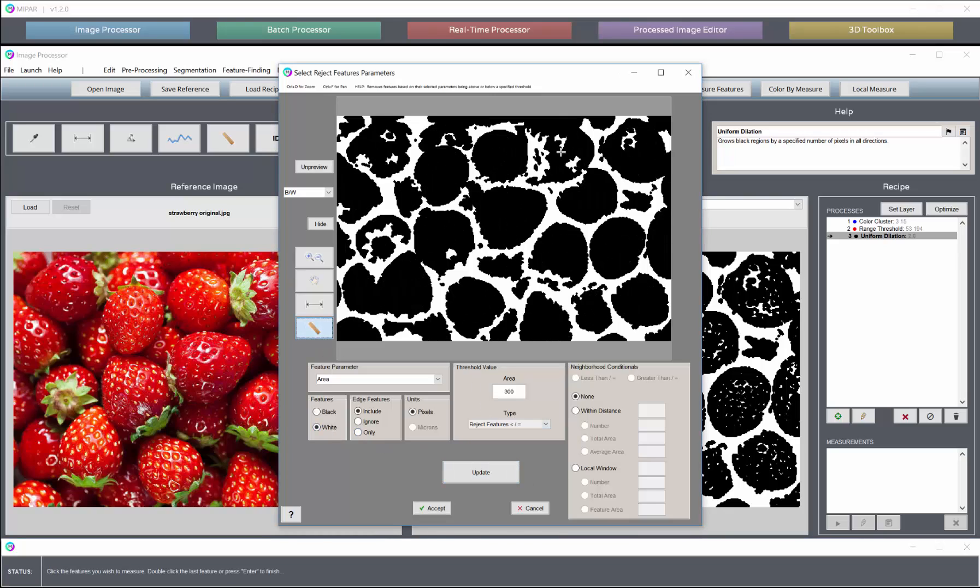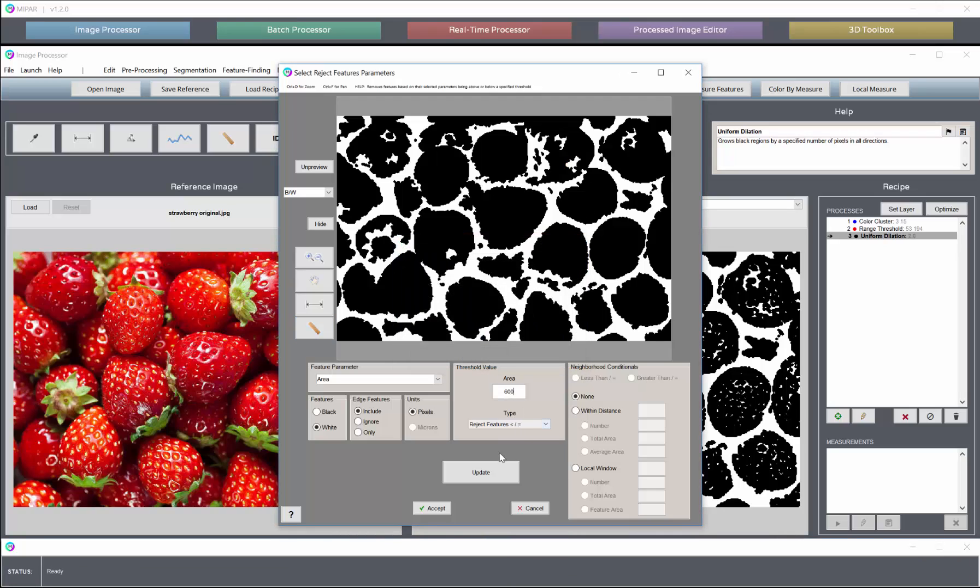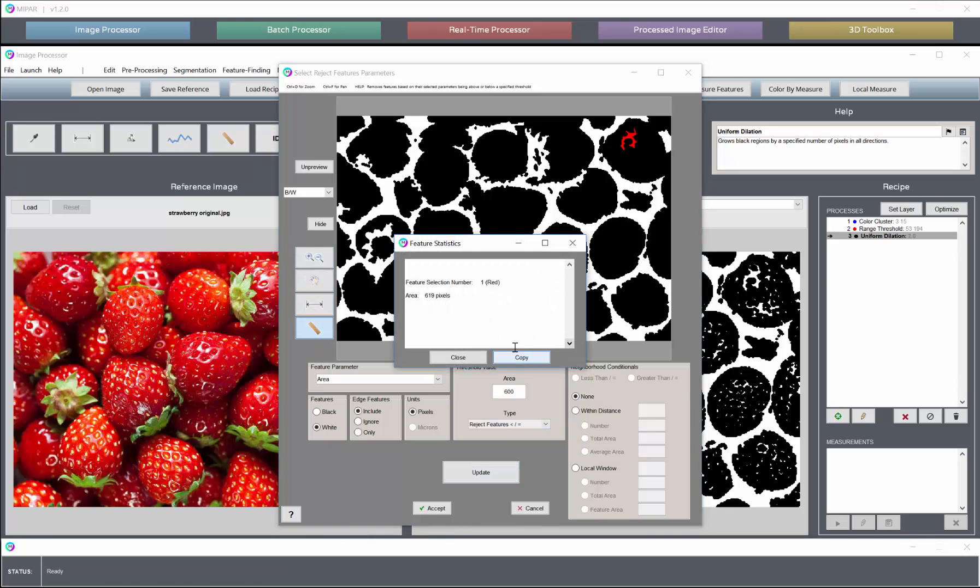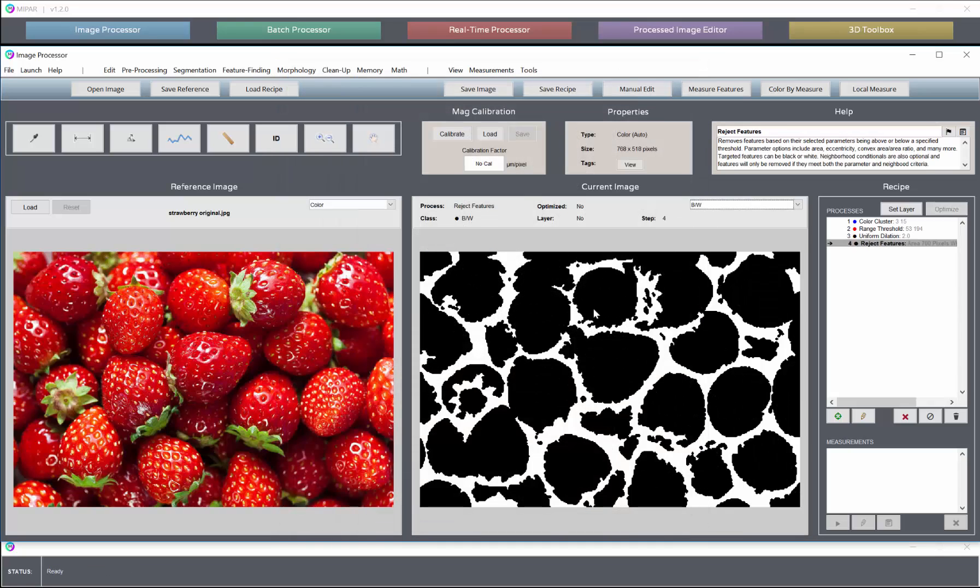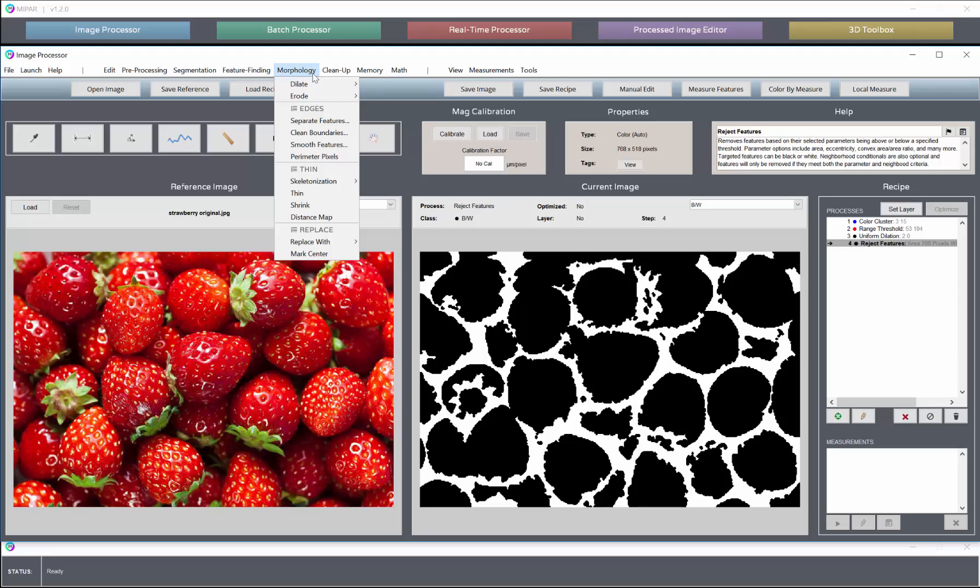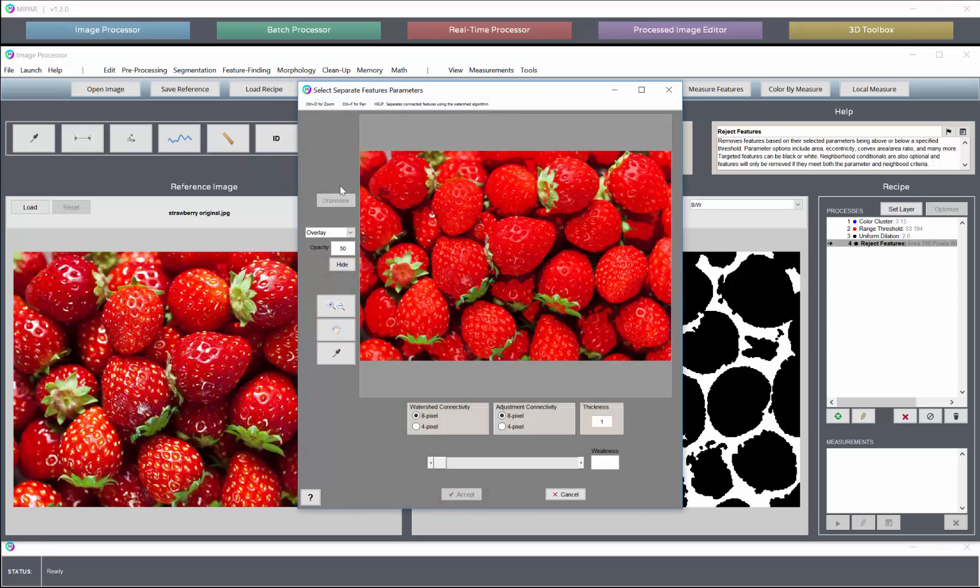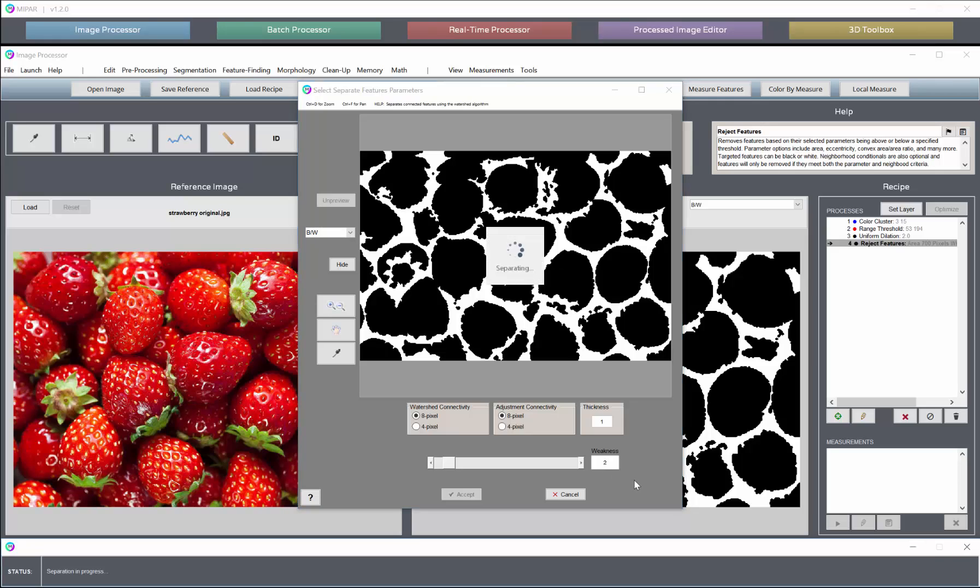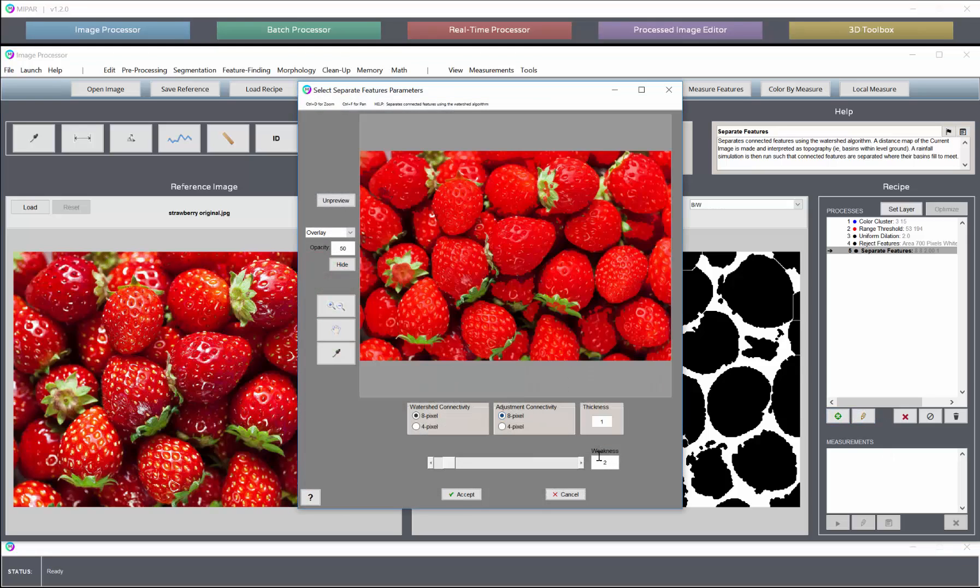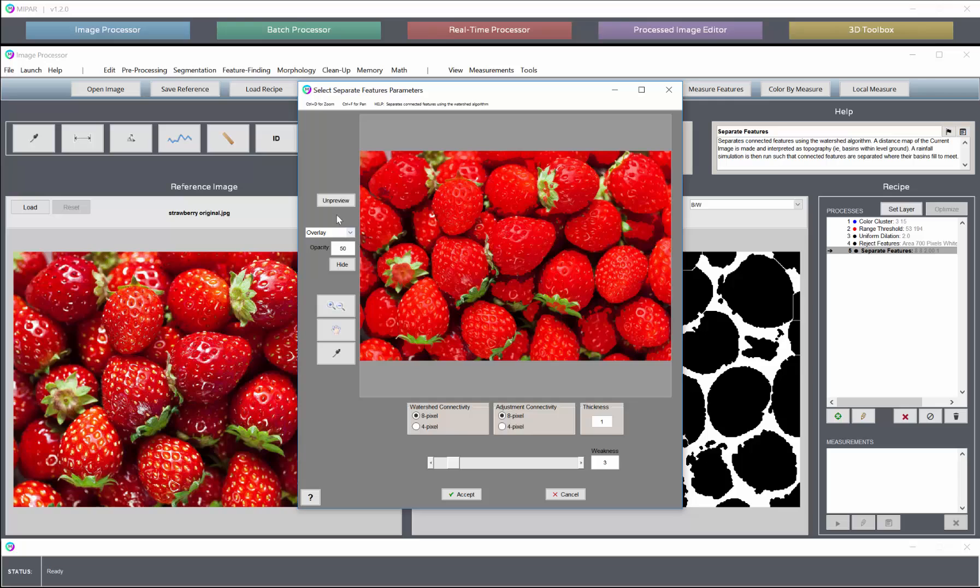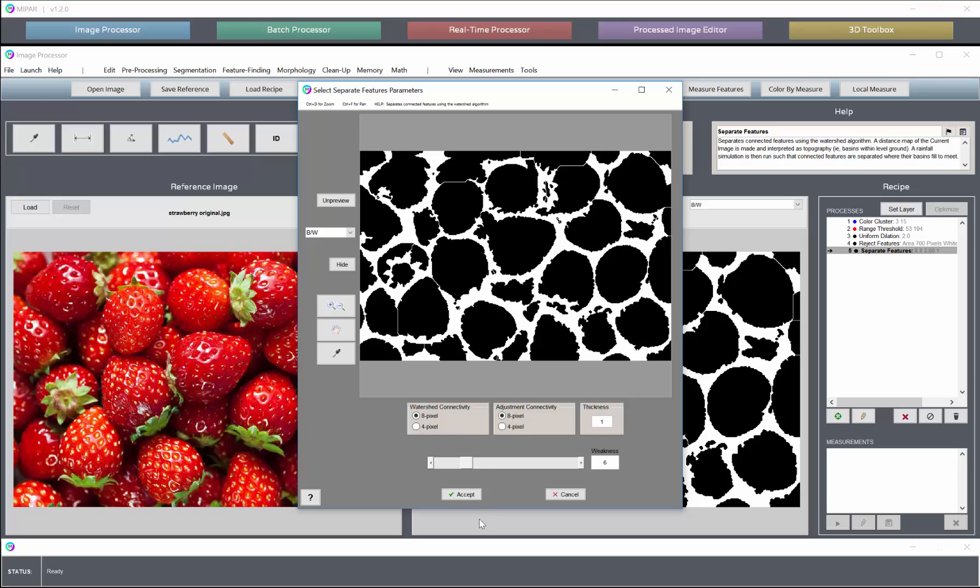Let's go a little bit more to make sure we get rid of all of the holes. Then let's perform a feature separation. Perhaps with a weakness of two. Let's try three to see if we can prevent some of the undesired separations. Six looks reasonable.